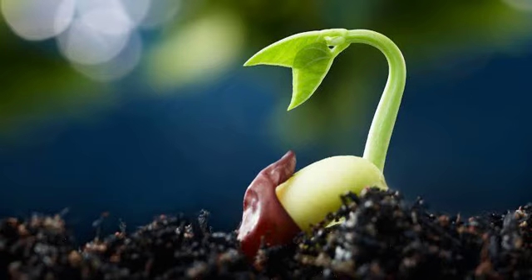Dead seeds: seeds at the end of the test period that are neither hard nor fresh and have not produced any part of a seedling. Often dead seed is soft, and a milky paste comes out when pressed at the end of the test.